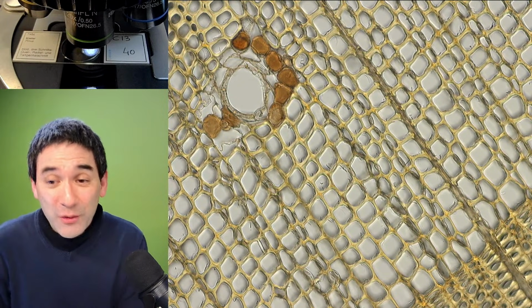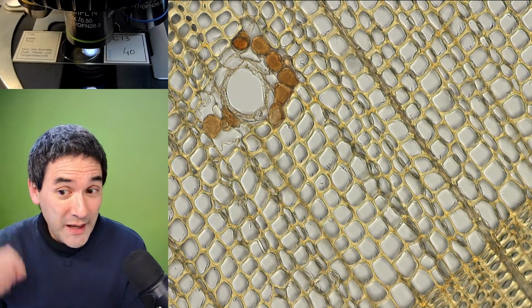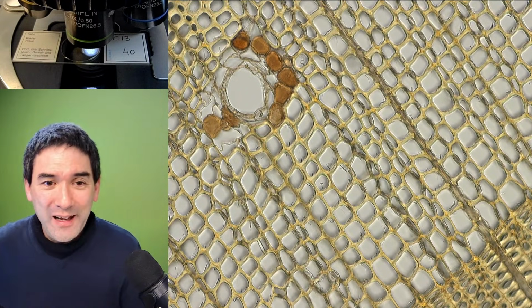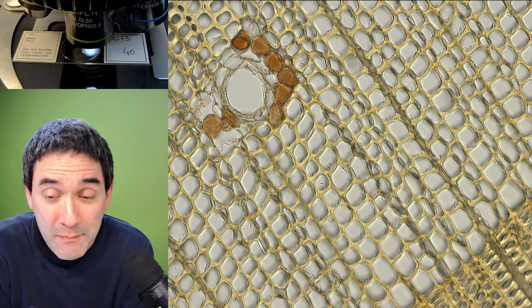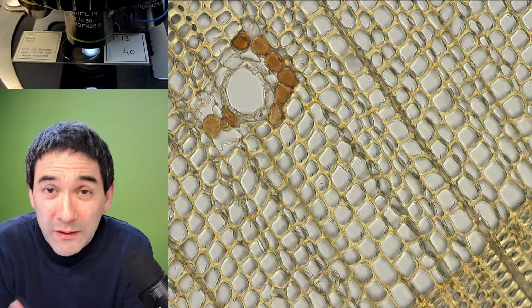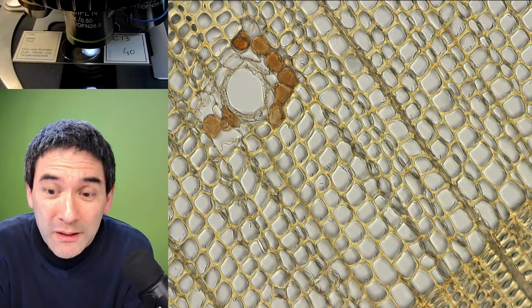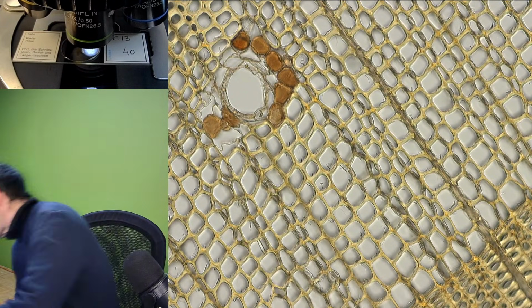Wow, you've got 1,000 slides, really? Honestly, that's way more than what I have. Usually, I make a lot of slides, and then I film them or take pictures, and these are just temporary slides, and then I simply wash them. What I usually do is the following.